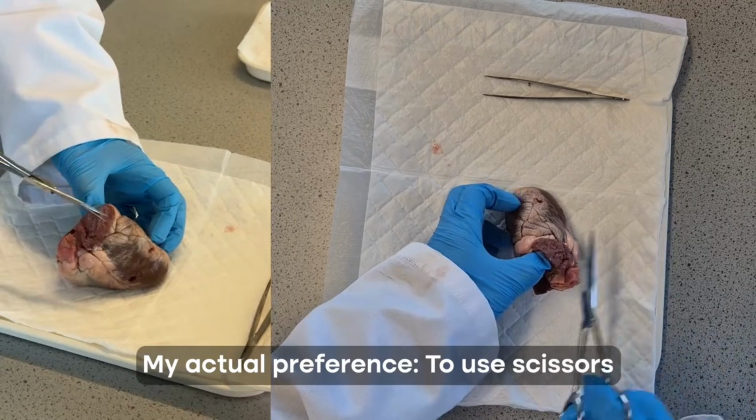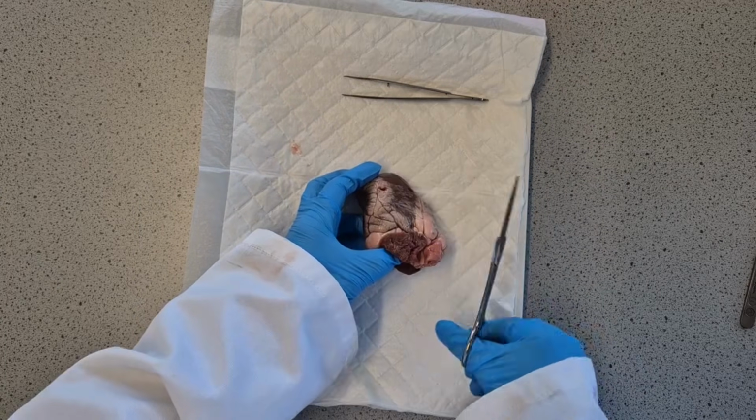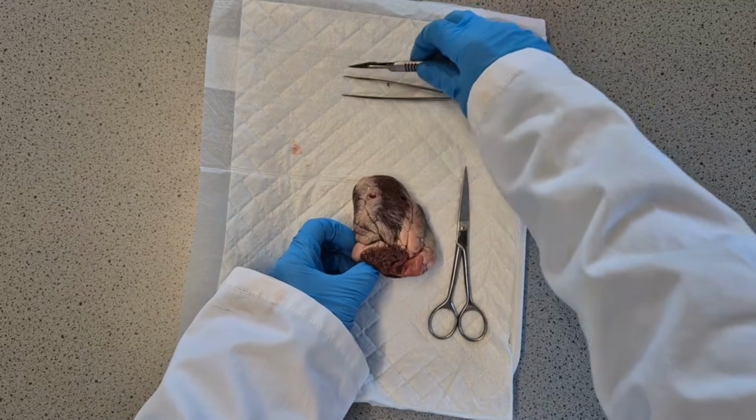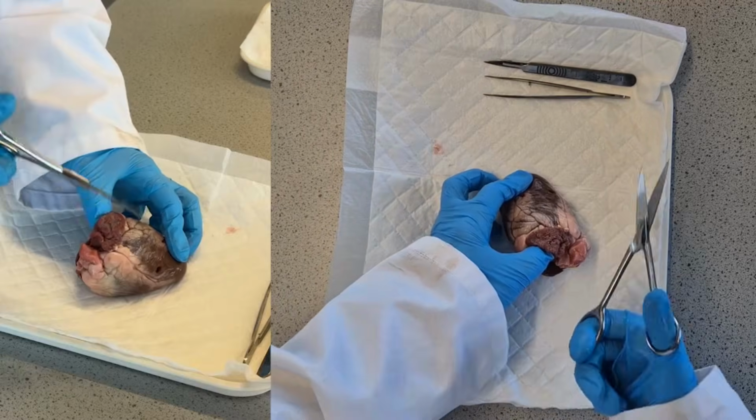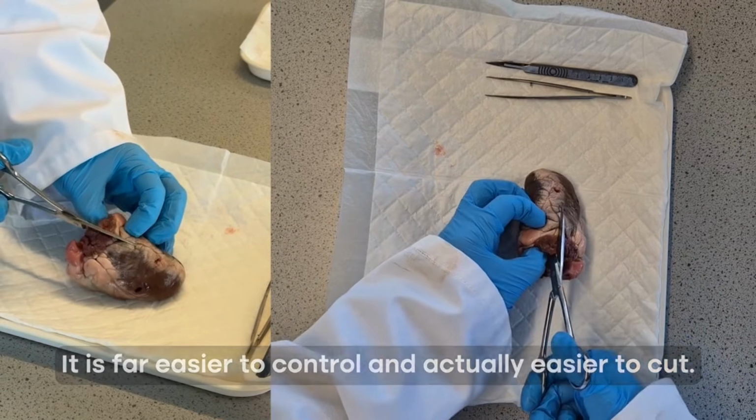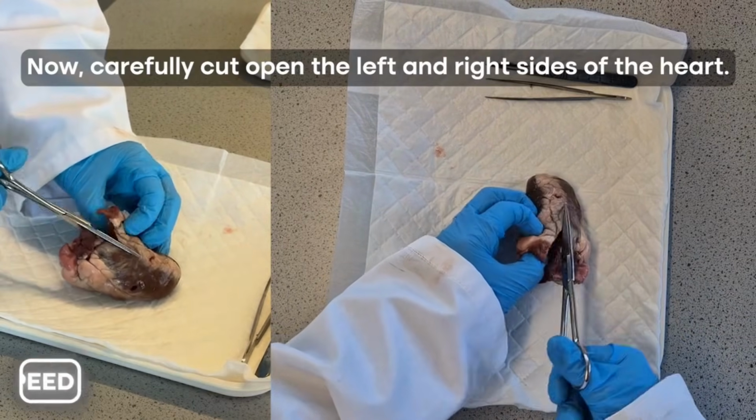Now, my actual preference is to use scissors. In the exam, they'd want you to say you use a sharp scalpel cutting away from you. I actually find that if you've got sharp dissection scissors, it is far easier to control and actually easier to cut. So I'd be cutting through.